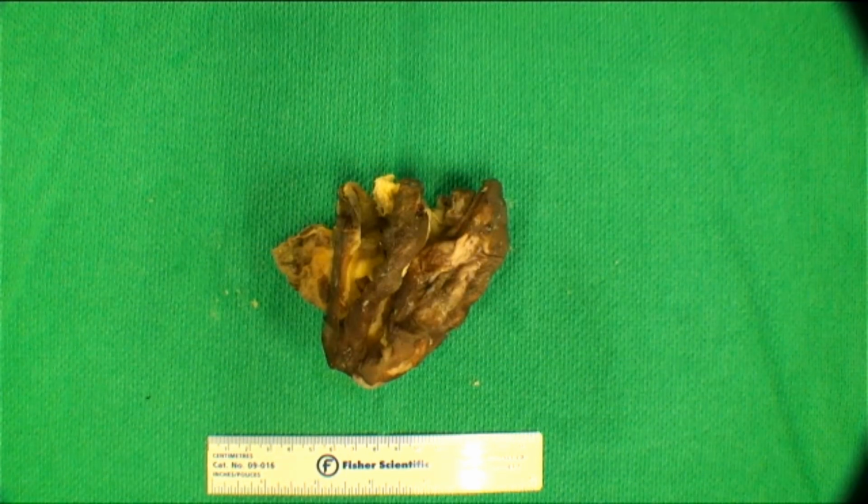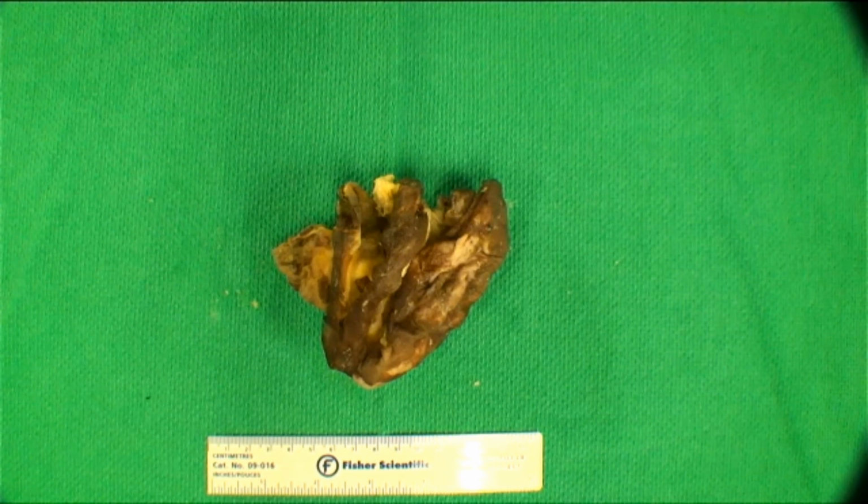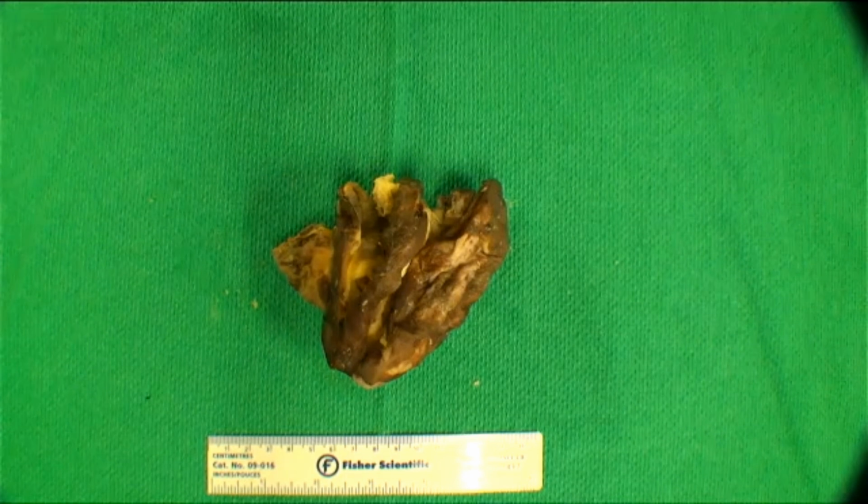Oh, there's a question, hold on. Does monodermal teratoma look differently grossly than this specimen? Yeah, they tend to be more solid. Depending on the degree of differentiation, they can be quite solid. Ideally, yeah, you won't have all the mess too. That's right, struma can look a lot like thyroid, that beefy red look. Yeah, I forgot about that, yes. It can be quite striking.